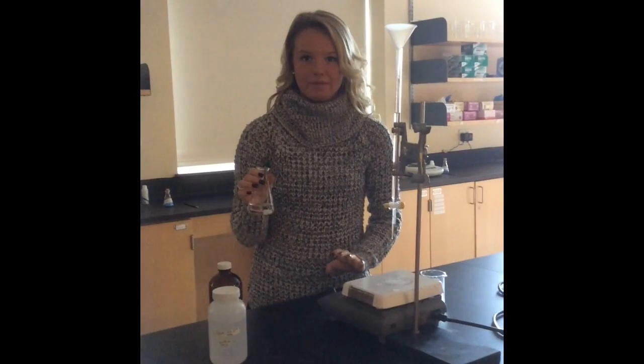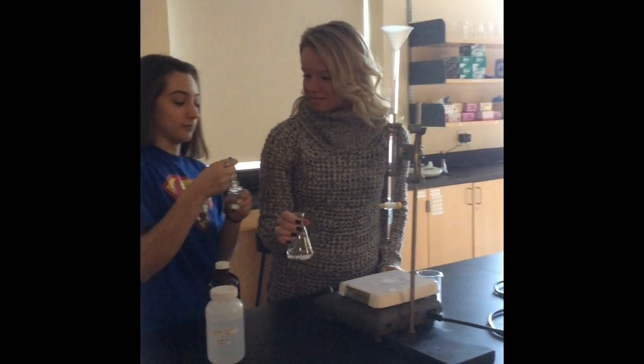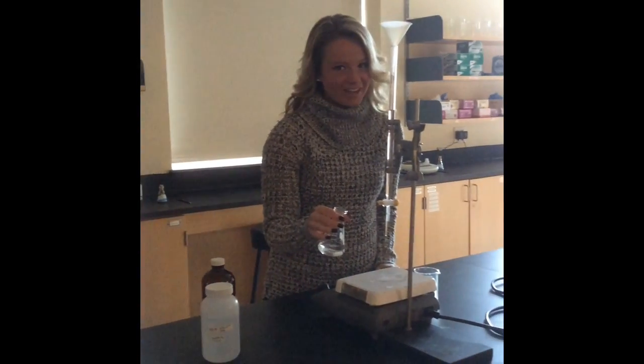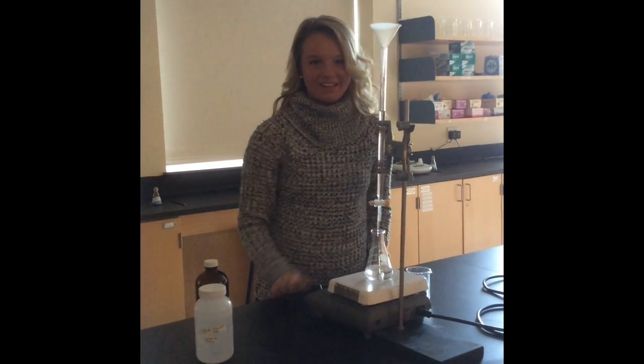Once all of your liquids have been poured in, we need 3 drops of our phenolphthalein in our acid. Can't forget it. Then, align your flask with the burette tip to start the experiment.